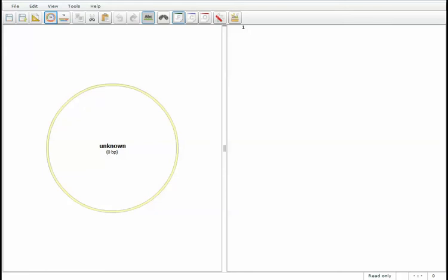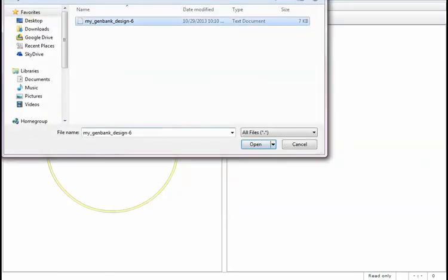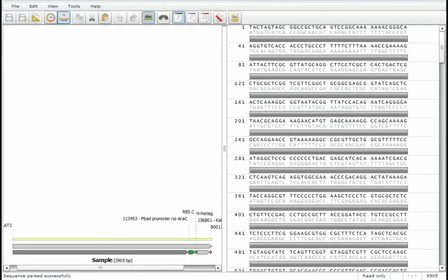All I have to do is click the File menu here and import that file. Now again, your file could come from various places depending on where you downloaded it, but you would access that file and import it here. I've got my text file, open that up, and all of the features that were carried out of the GenoCAD tool are now available for me here.